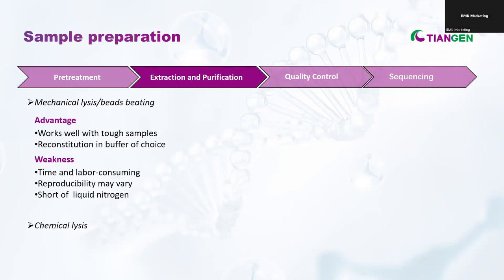After we collect the sample, the choice of DNA or RNA isolation method could cause bias during sequencing, which in turn affects downstream analysis. Importantly, the extraction method should effectively capture all types of microbiomes. For example, DNA isolation from gram-positive bacteria is harder due to their thick peptidoglycan cell wall.